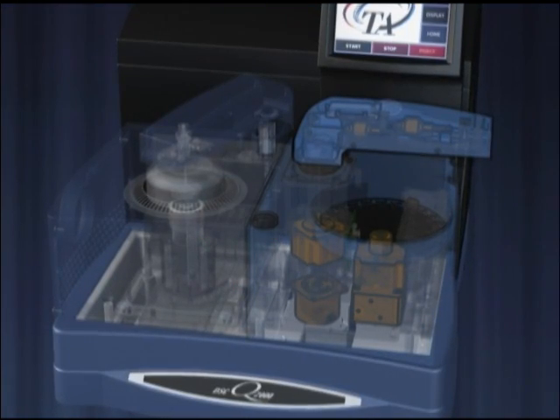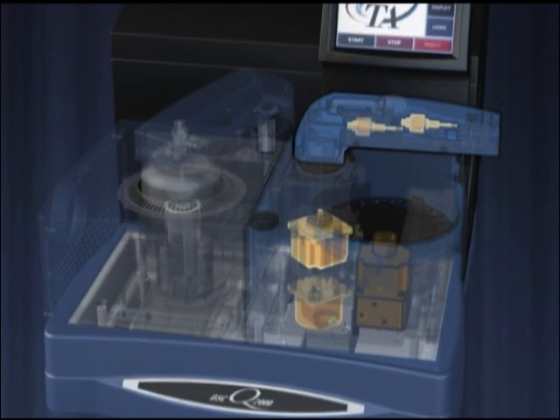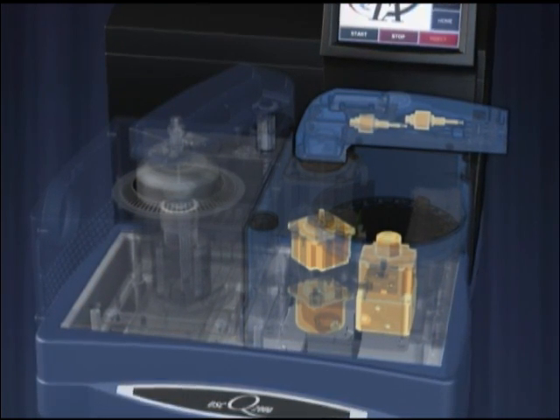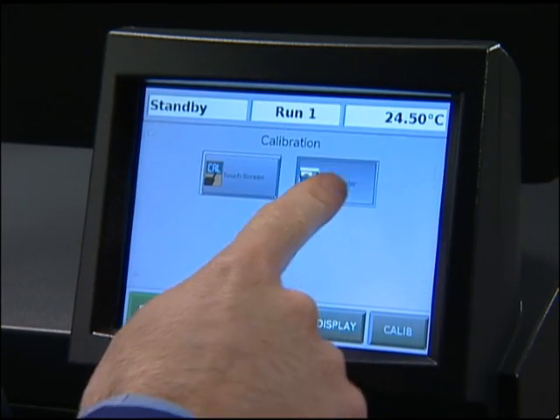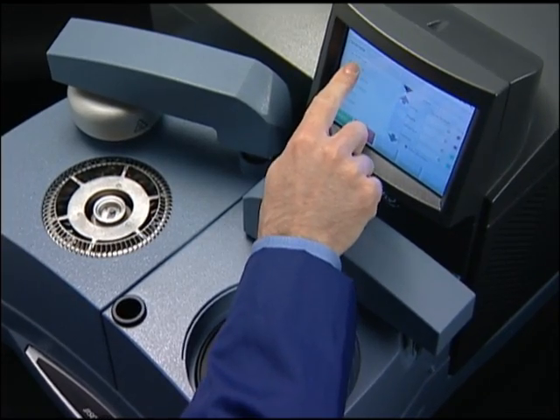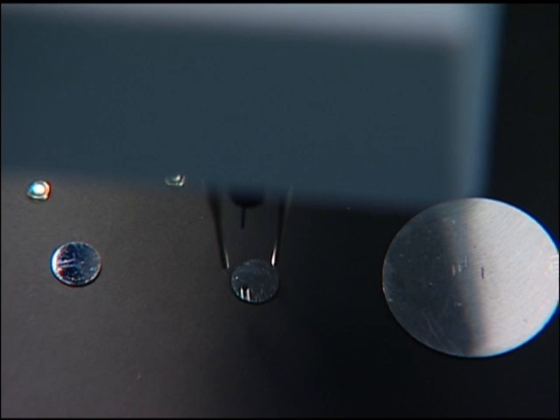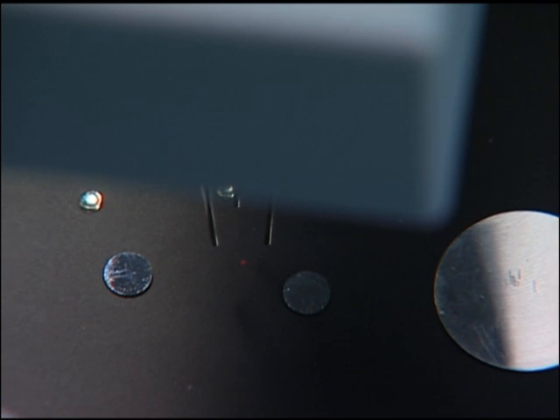The rugged Q-Series Auto Sampler employs four separate motors for continuous operation. Precise sample placement guarantees accurate and reproducible DSC results. Auto Sampler calibration is also simplified with the Q-Series integrated touchscreen and unique photodiode sensor, which ensures reliable sample pan acquisition.